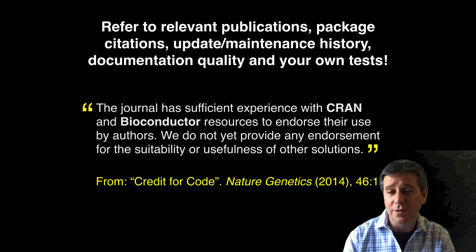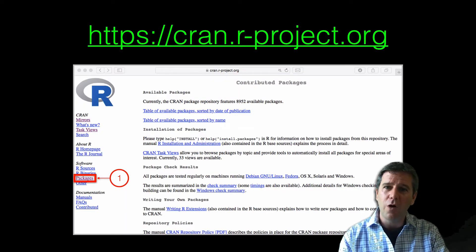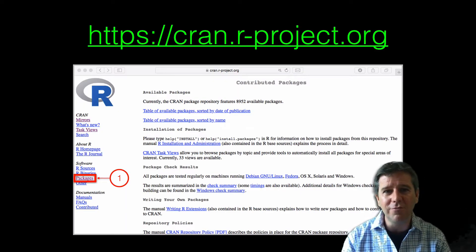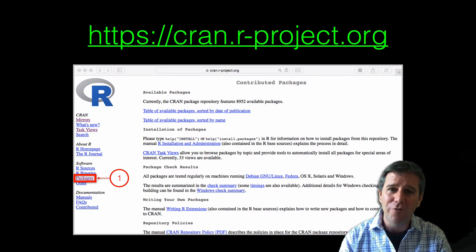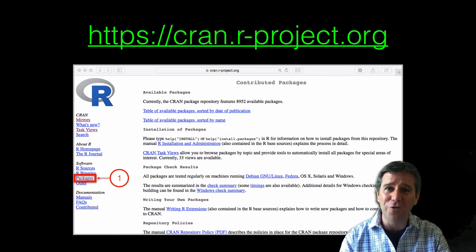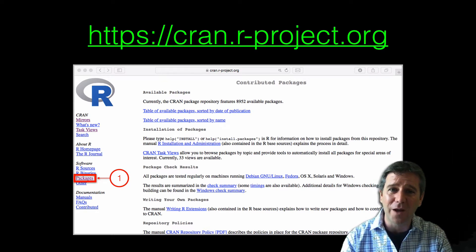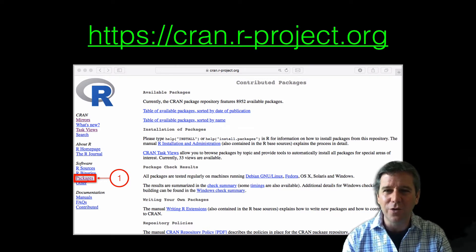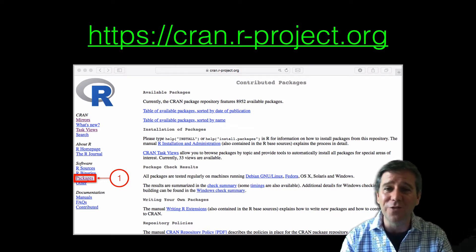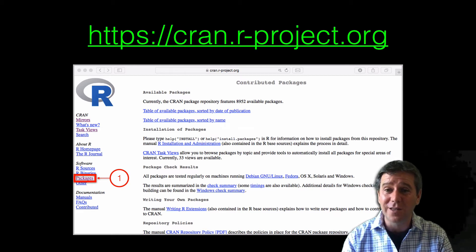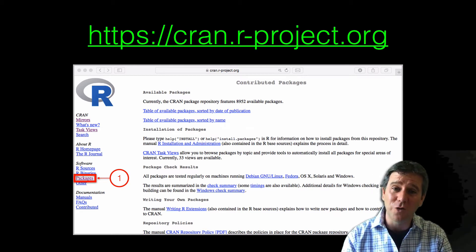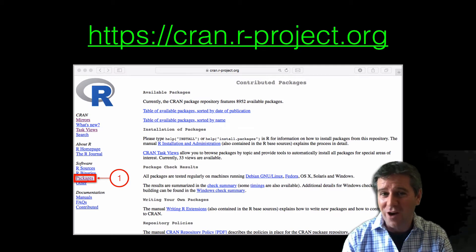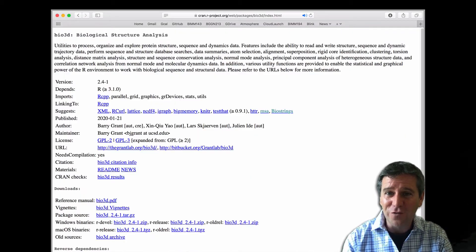So where do we get these packages from? On CRAN you can go to the CRAN website — this is where you went to download R itself when we began our course. You can see down on the side, where I've added the red annotation, there's a list which will take you to an alphabetical listing of these 16,000-odd packages, which is rather unuseful of course.